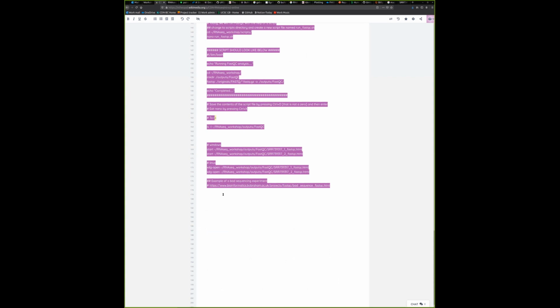You can open up Notepad, or I think on Windows there's another, was it Notes or something? You can do so, but please make sure that if you run into a problem running the script, the reason is that the encoding of that particular program is not compatible with shell. This is something you don't see, but in the background, all of your text files have some sort of encoding to them. So that's why I'm using Nano, which is safe for now.